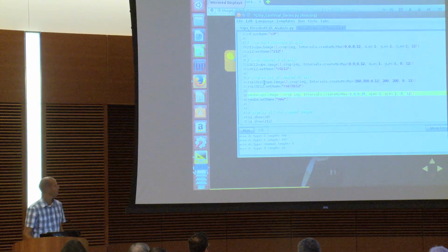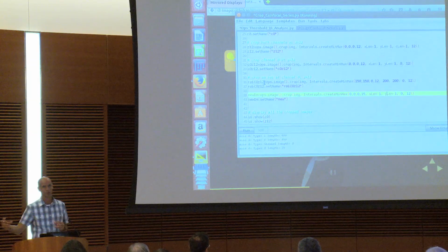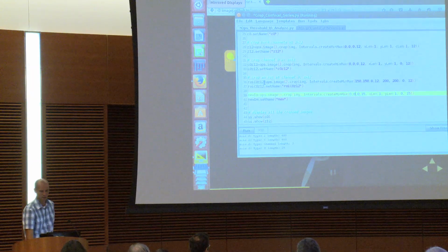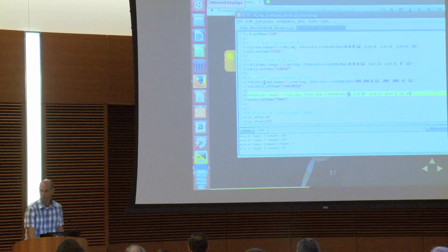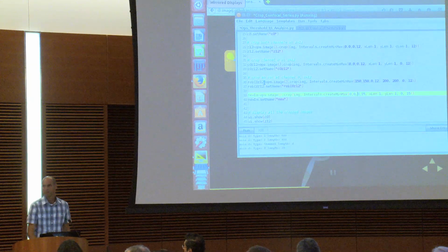When you're creating these intervals, it's just a starting point and an ending point. So the first 4 parameters are the starting point. The second 4 parameters are the ending point. So this says start at 0, 0, 0, 15, and end at the end of the data set, the end of the x dimension, end of the y dimension, 0 and 15. So this is sort of inclusive. 0 to 0 means crop out just 0. So this crop parameter implicitly assumes you have 4 dimensions and then x and y.